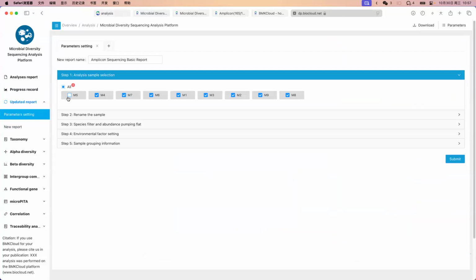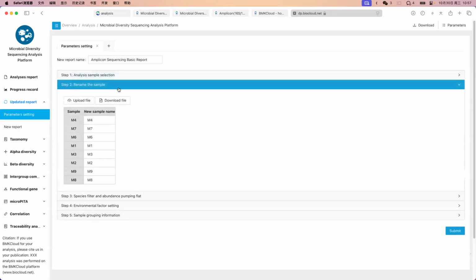This is out of group and have the this don't have a good QC result, and I want to remove it. So unclick here. You can rename the sample's name.